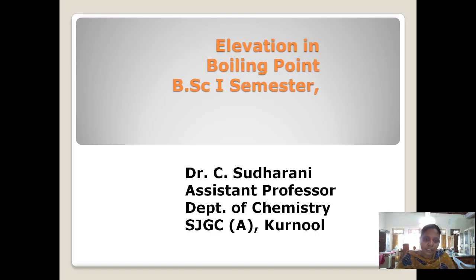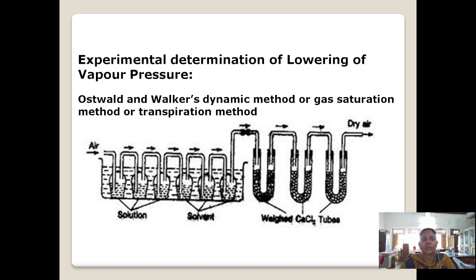Good morning, students. Coming to the second module. In this module, we are going to discuss the experimental determination of lowering of vapor pressure as well as elevation in boiling point. So first we will see what are the basic requirements for the experimental determination of lowering of vapor pressure.